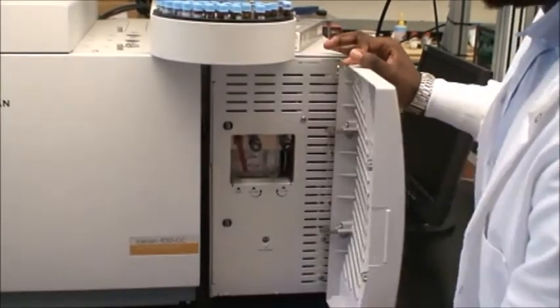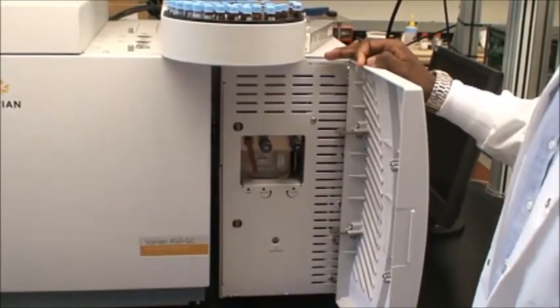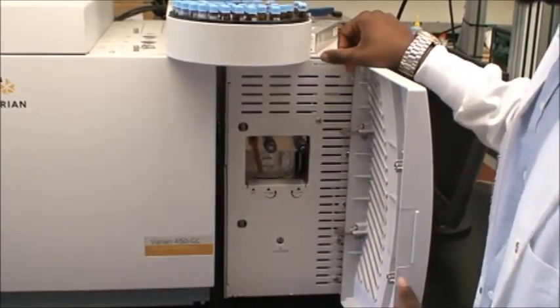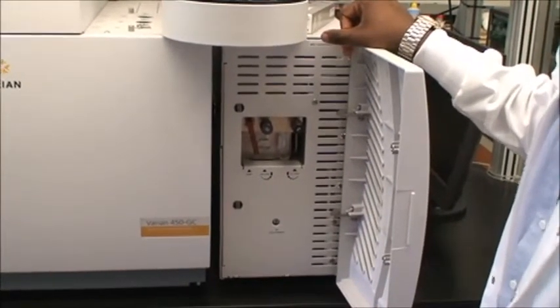On this side of the GCMS, we have the detector. This is a mass spec which is responsible for the spectrum that you'll see after your sample is analyzed.